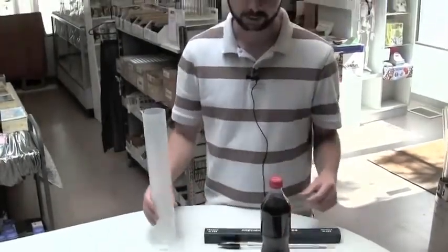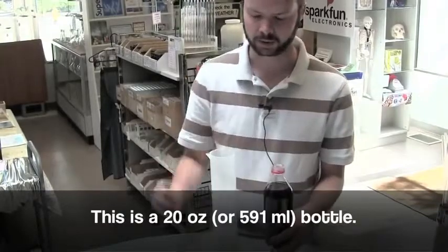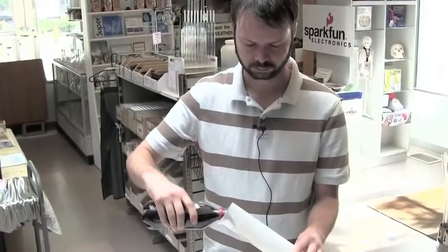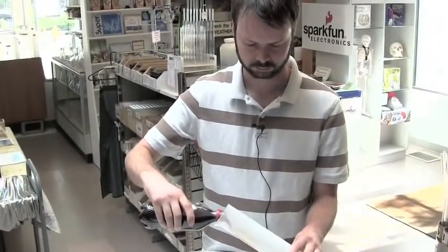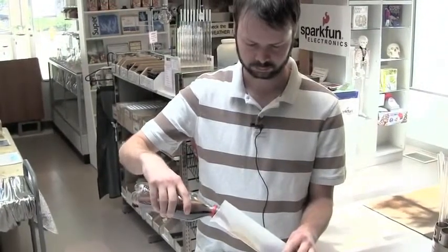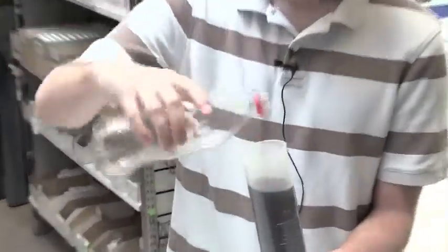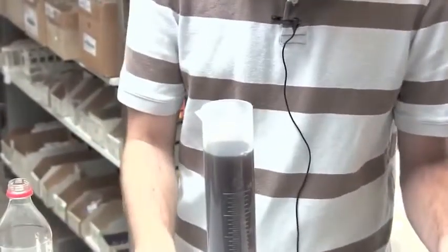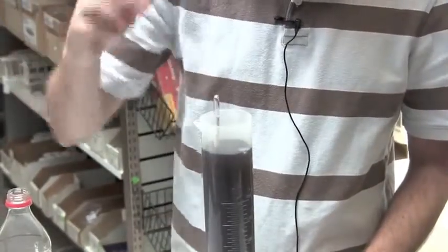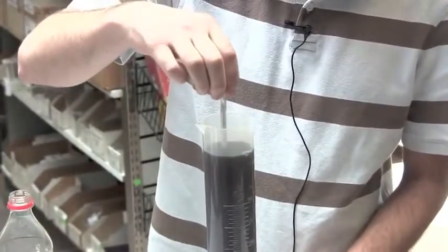So after you've got all your supplies together, take note of the volume of your beverage in milliliters and pour it into the graduated cylinder carefully. Next, take your hydrometer and gently set it in the beverage. Turn the hydrometer slightly to release any bubbles that may have been trapped underneath the hydrometer.